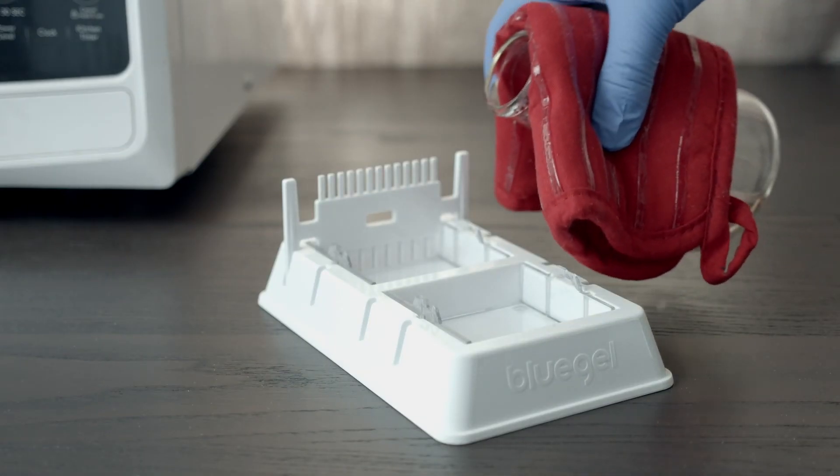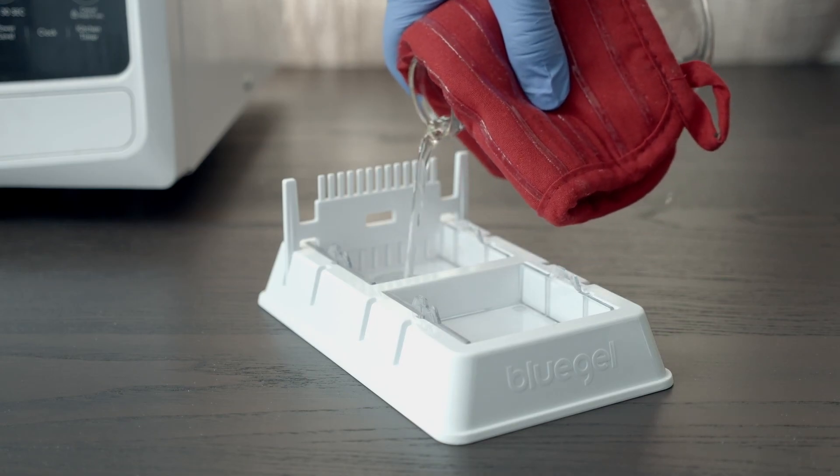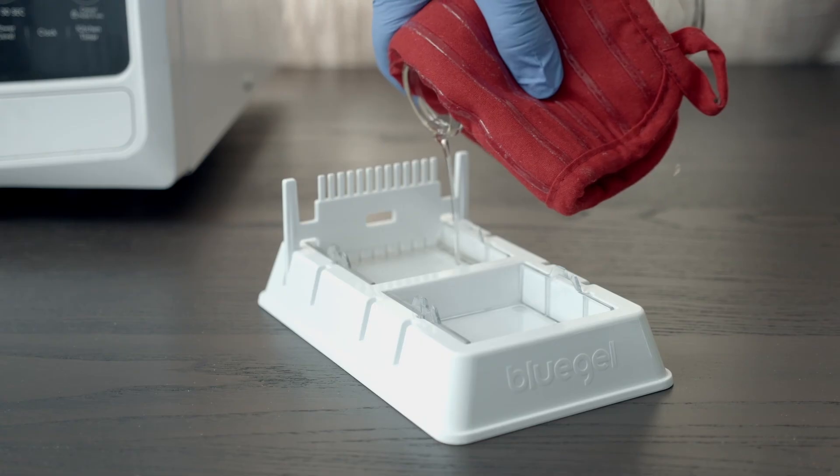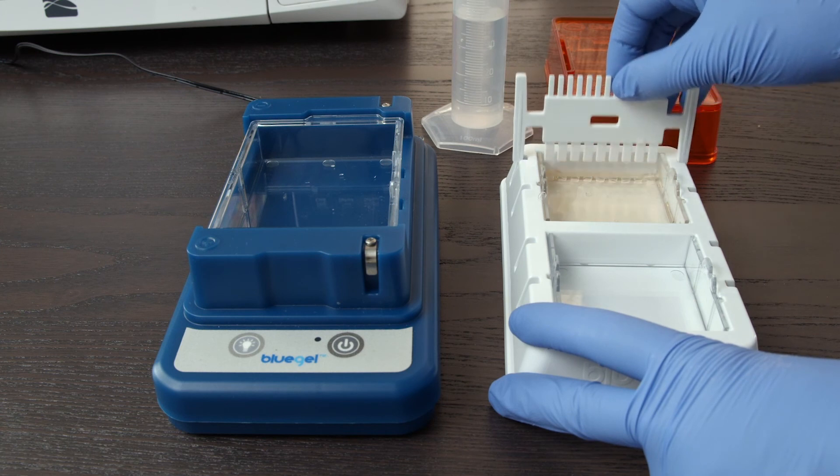Pour the gel into assembled gel casting trays. Make sure you've inserted the combs to create wells. The gel will set in about 10 minutes and once cooled it should feel firm like jello. And that's it. Now you're ready to remove the combs and load your gel into your electrophoresis box.